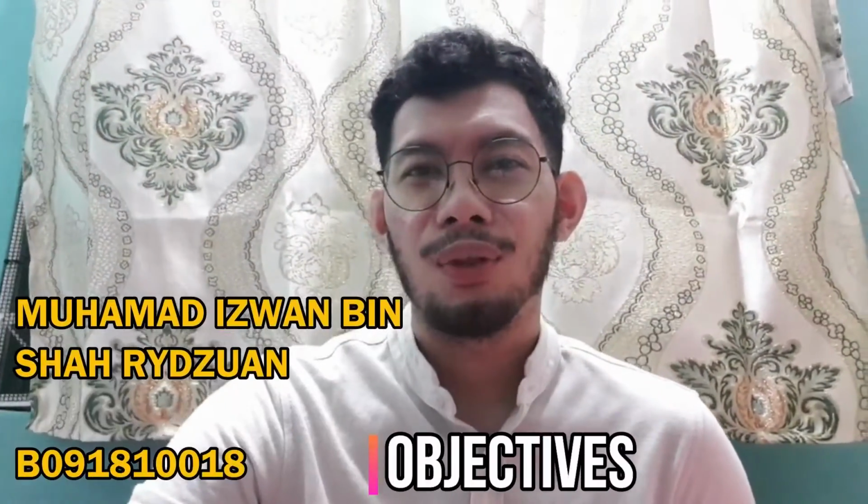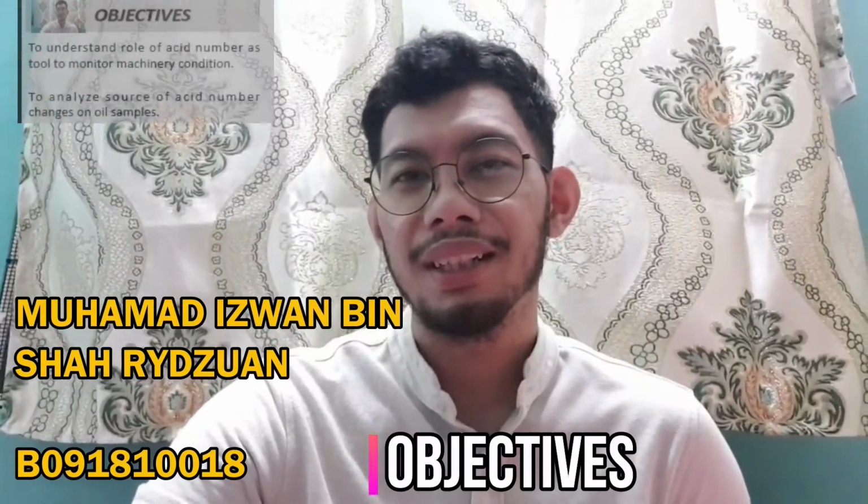Okay, the objective for the total acid number, Lab 3, is to understand the role of the acid number as a tool for monitoring the machinery condition. That's the first objective. And the second one is to analyze the sources of the acid number that can change in the oil sample. So that's the objective for this lab.